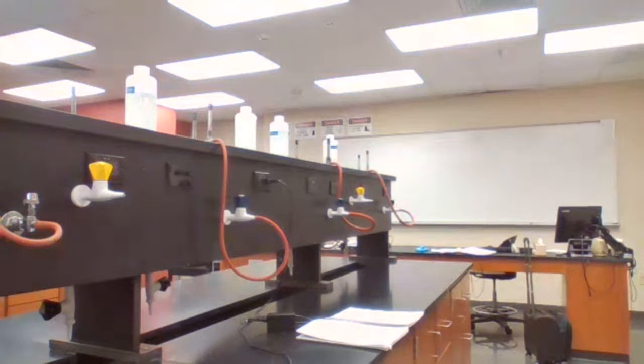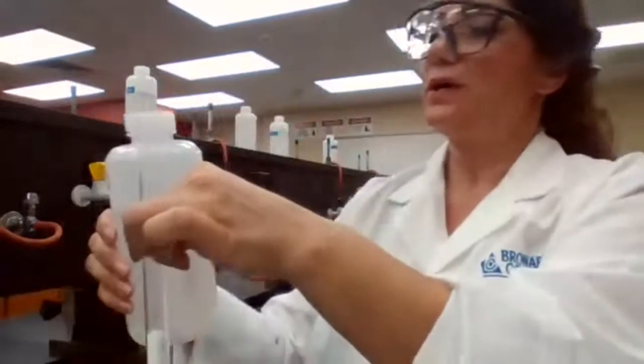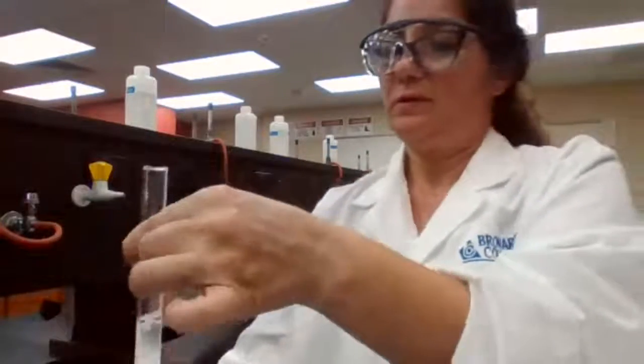It's going to try to dissolve the solid ammonium chloride in water.